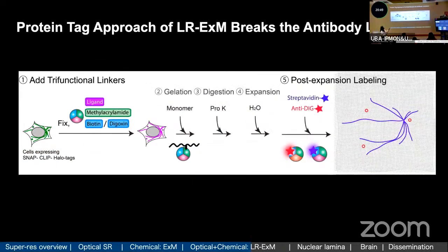And the steps are similar to the antibody approach. It's just the first step: you don't need the antibody anymore. You need to express the protein tag in your cell.